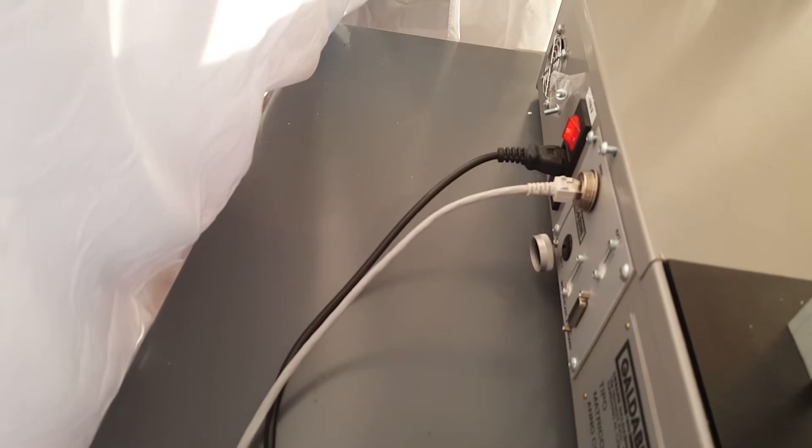Let's take a look at the back panel. I just have two cords coming out: one is the ethernet cord and the second is the power cord, and that plugs right into my PC here.